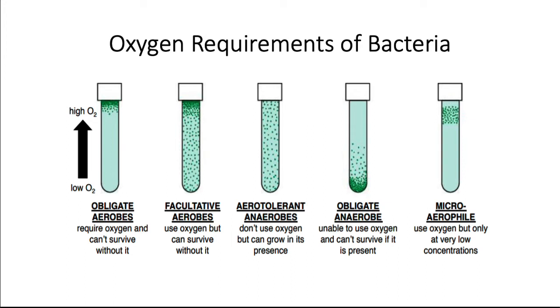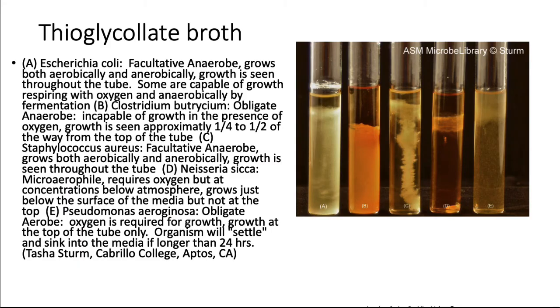And these microaerophiles, they use oxygen, but at a lower concentration than the oxygen present in the atmosphere. So they are going to grow a little bit further away from the oxygen, but not everywhere, because they still require oxygen. So how does this look in real life?